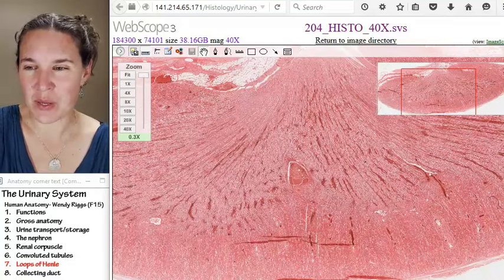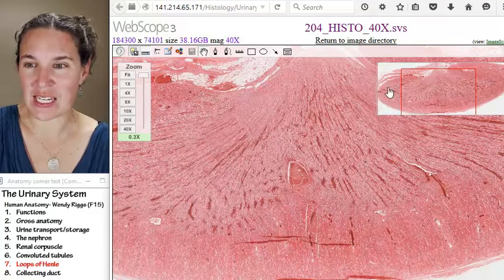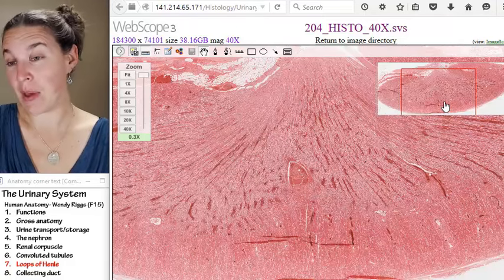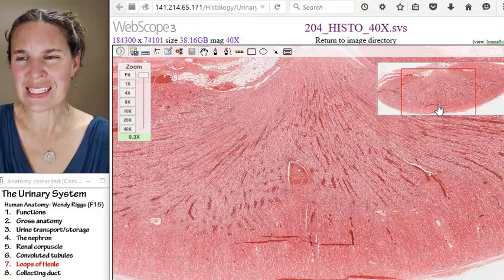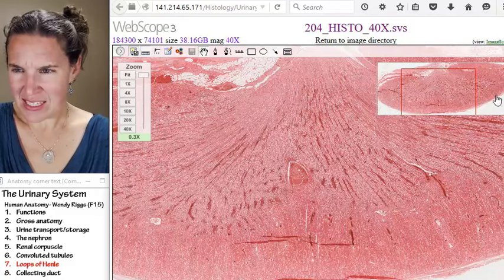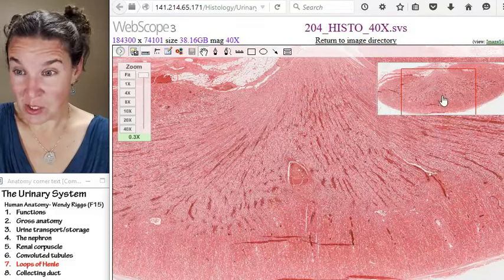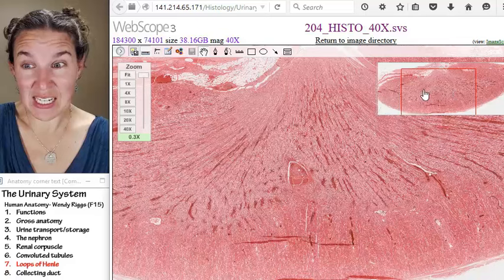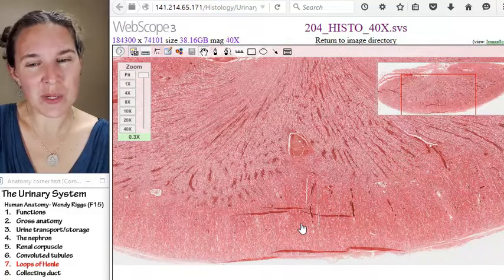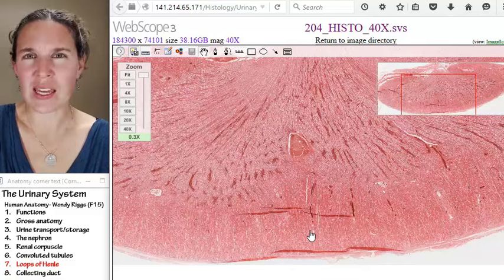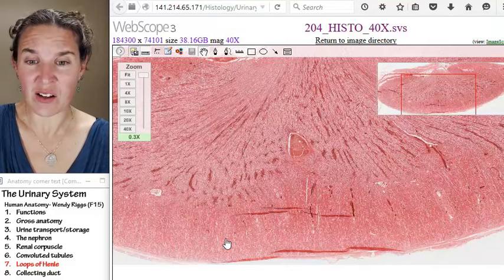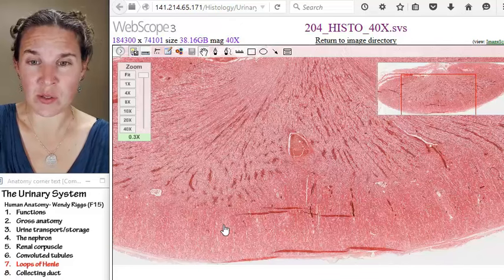If you take a look at the big picture of this kidney, I can totally see the cortex out here — I can see that line — and then I can totally see the medulla of the kidney. Do you agree with that? I can't see renal pyramids, and that's okay, but I can definitely tell the difference between cortex and medulla.